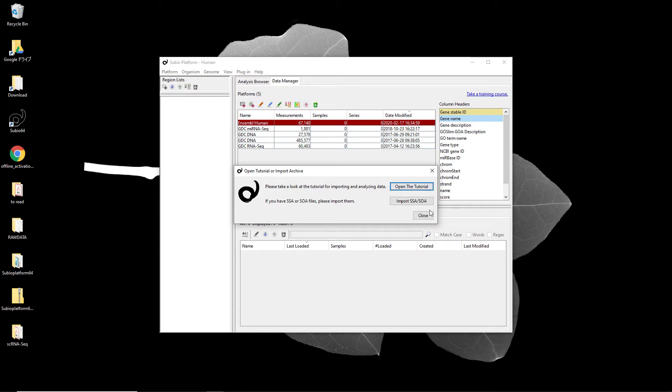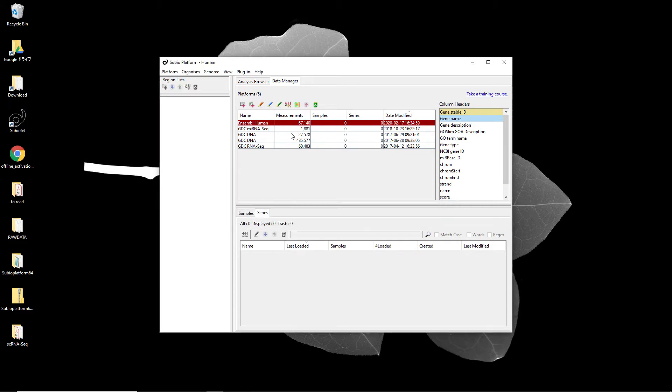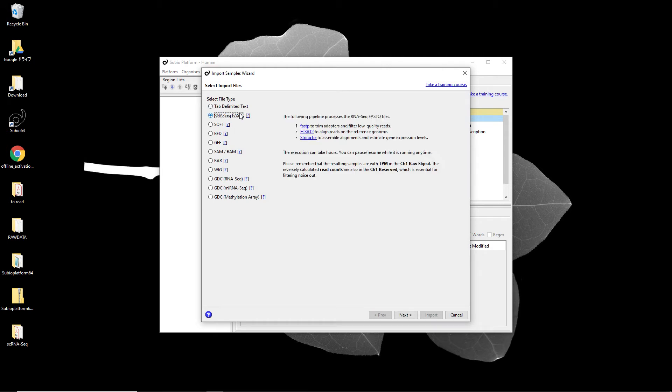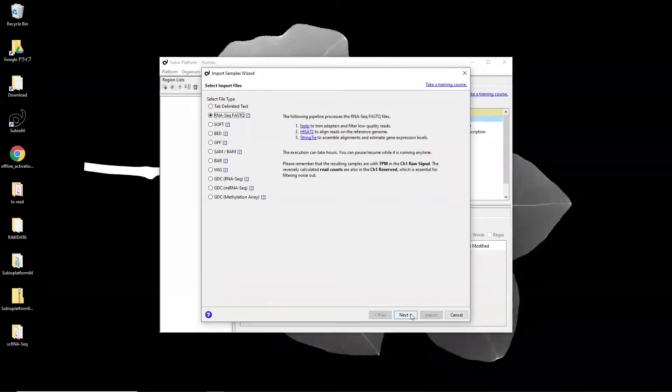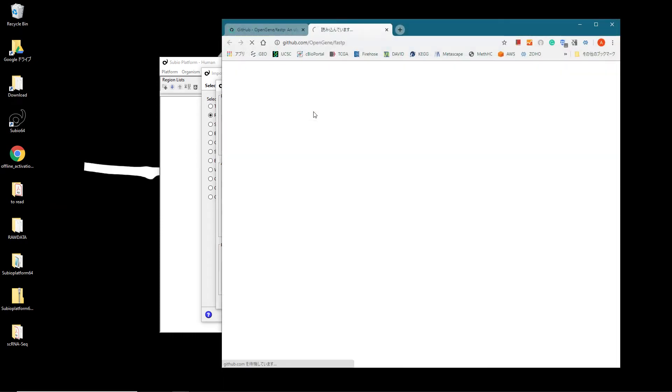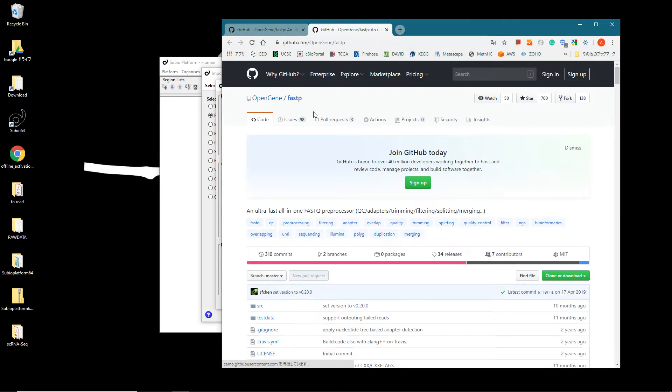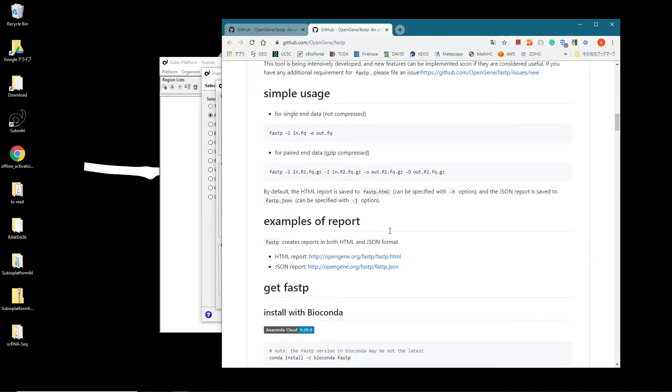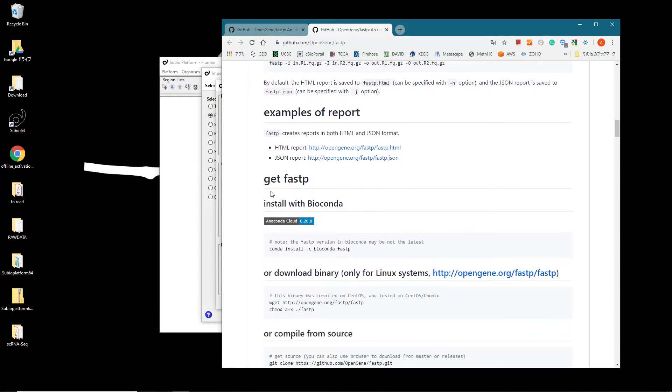Open the Import Samples wizard and select the RNA-Seq Fast-Q option. You can click the Next button this time. Click the link at the FASTP executable section.